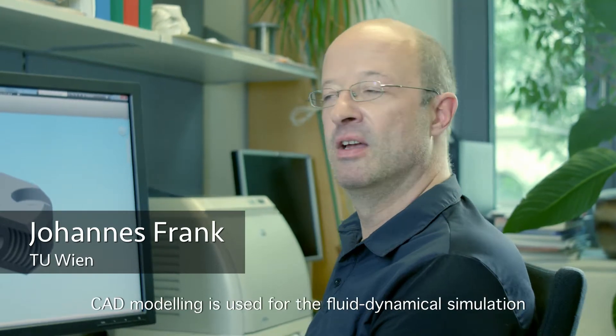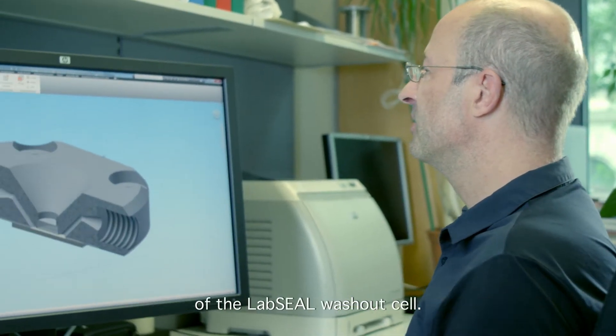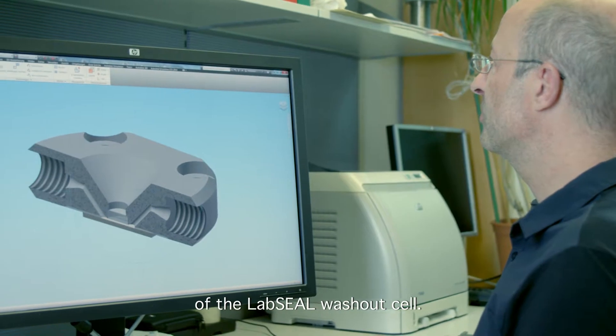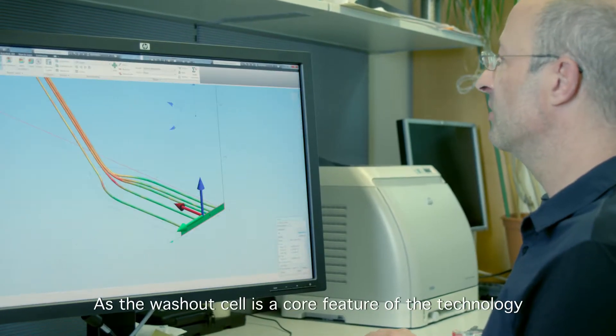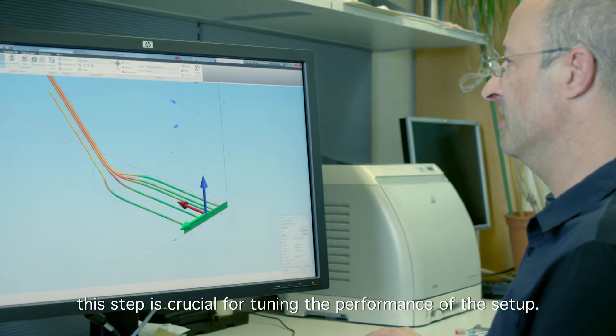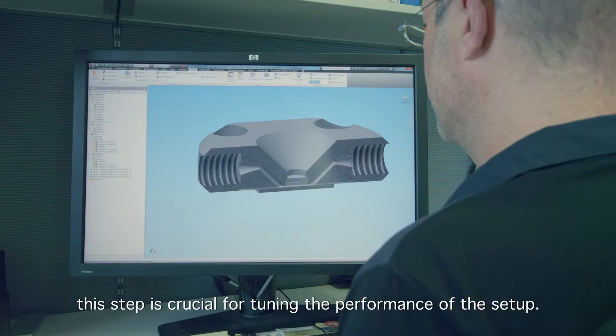CAD modeling is used for the fluid-dynamical simulation of the LabSeal washout cell. As the washout cell is a core feature of the technology, this step is crucial for tuning the performance of the setup.